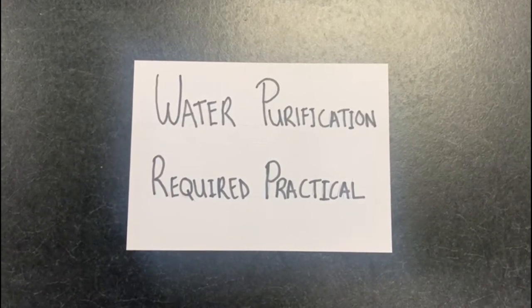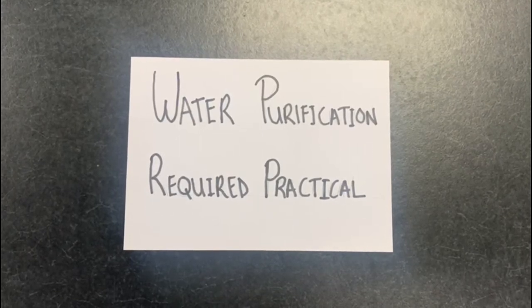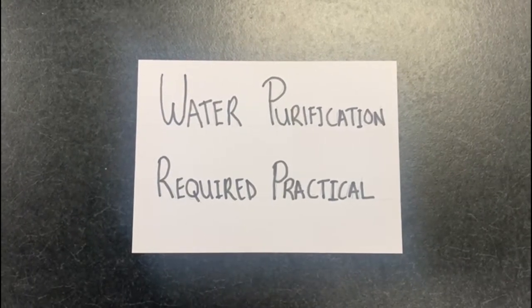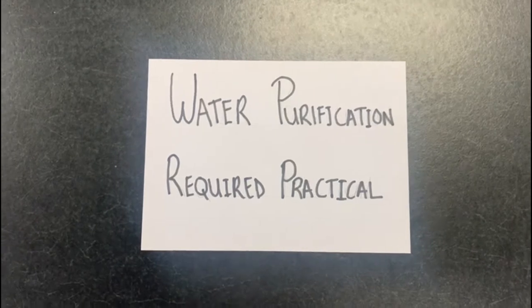Today I'm going to talk you through the water purification required practical. This practical you will need to know for your GCSEs. So this practical is actually split into three activities and I will start off by explaining activity one.